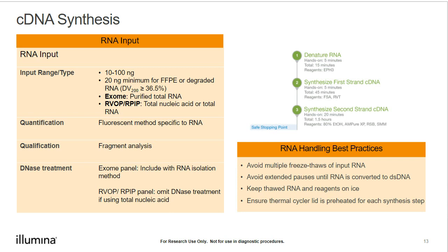Above the table here, we see the steps from the workflow diagram. And note that completion of cDNA synthesis is a safe stopping point. So if you'd like to proceed with the library prep the next day, you can check the reference guide for those storage details.